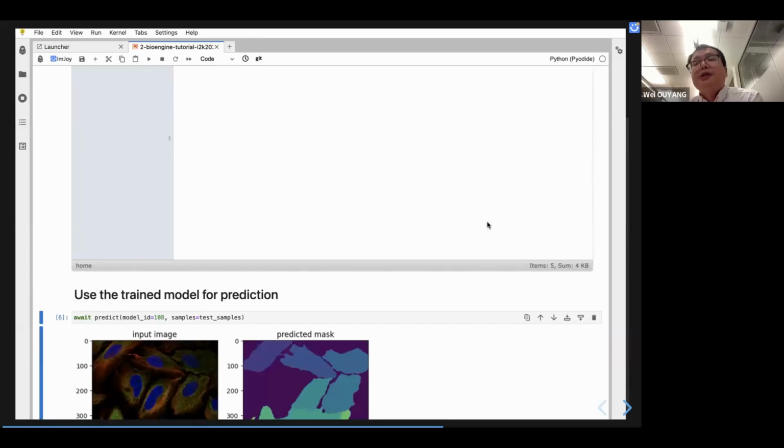Actually, all those are going to be packaged into Docker containers, right? So if you have Docker installed on your workstation or laptop, you just need a single command, docker compose up, and then you're going to have all the components ready. So it's actually quite modular, so you don't need to touch many of the things.